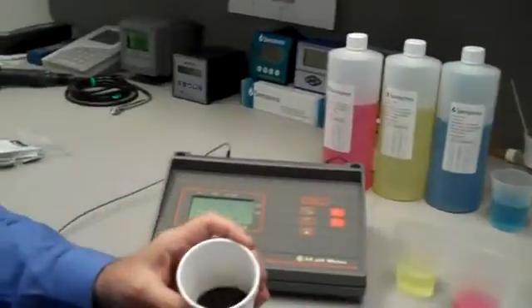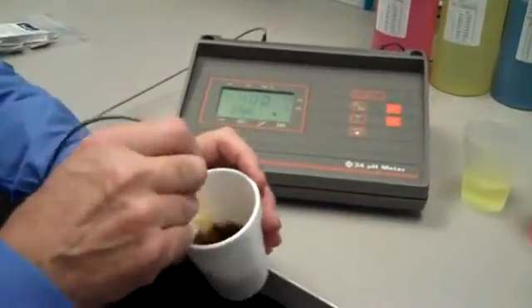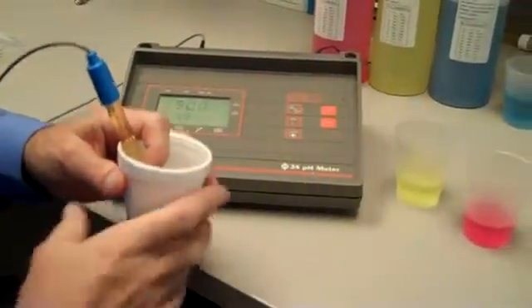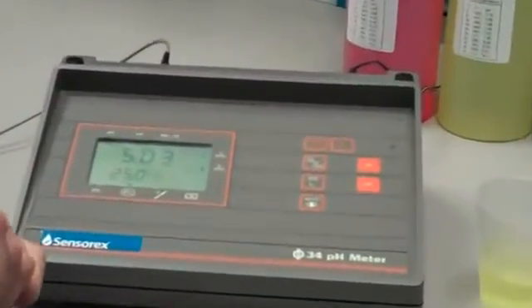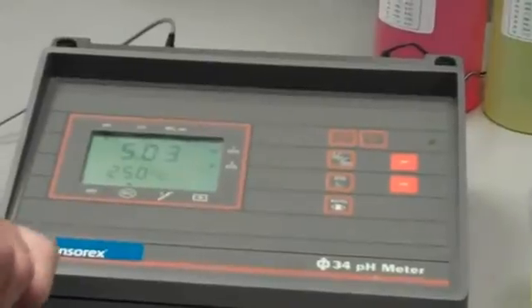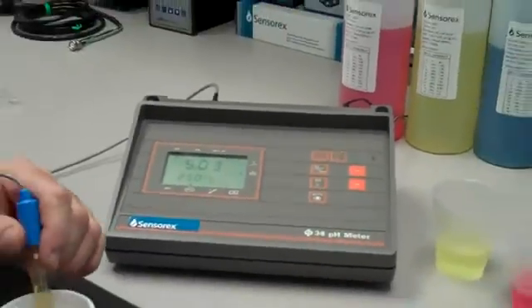I have some coffee that I've been drinking today. We'll swish the electrode around in the cup of coffee, and my coffee that I'm drinking today is a pH of about 5.03. Slightly on the acidic side, but the coffee sure does taste good.